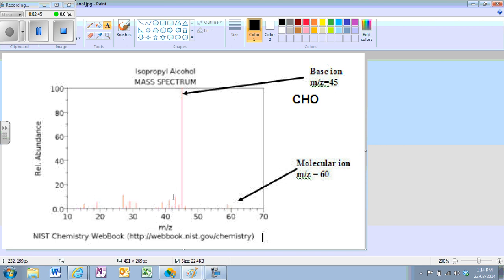Some of the spectra that you'll see will be simplified spectra, so you may not get every single peak. And here, the other thing I was going to point out, I don't know if it's that easy to see, but there is a very, very tiny bar on this point here at 60. It just doesn't show up very well in this imaging, but there's a tiny little bar there. So on the exam, just want to clarify with you, it would be very, very clear what you need to know and what the peaks are and what they're labelled. So hopefully that just reassures you of that.